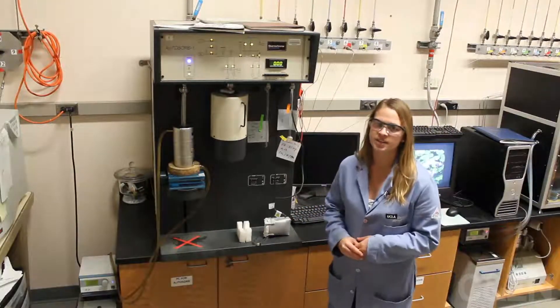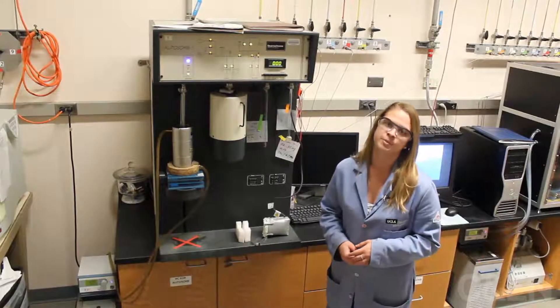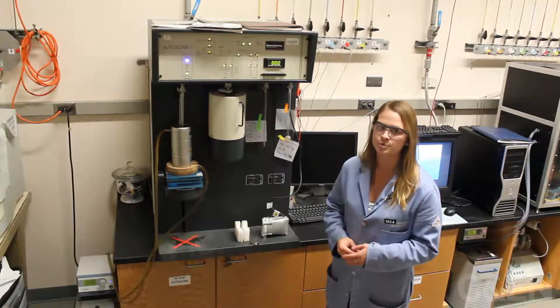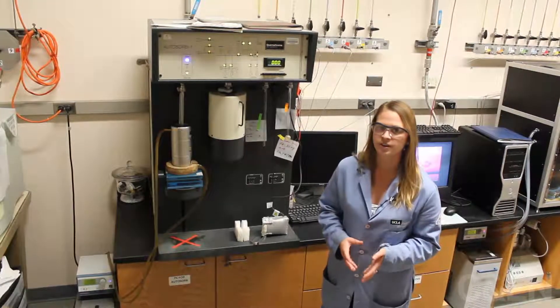This instrument gives us insight into the surface area and porosity of our materials. It also gives us information about the capabilities of our materials for gas adsorption — for carbon dioxide, methane, hydrogen, and other gases such as nitrogen and argon.